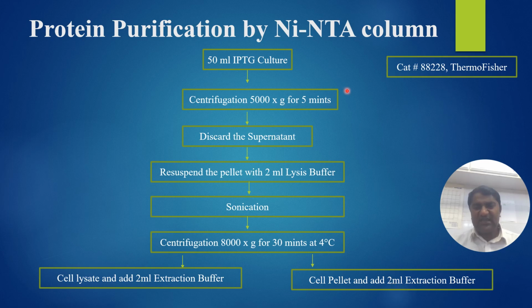This is the method according to this kit, the catalog number is 88228, that is the Thermo Fisher kit.